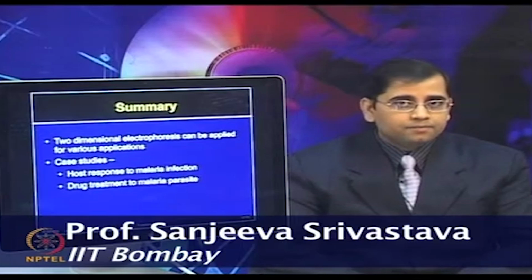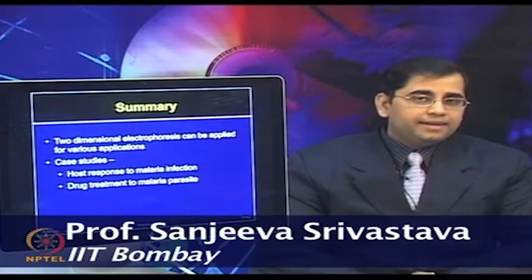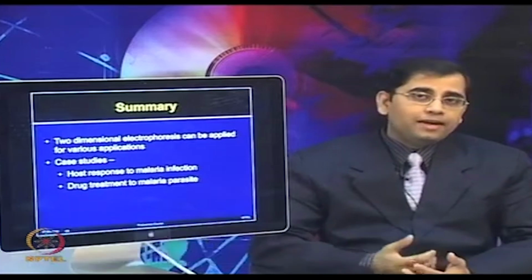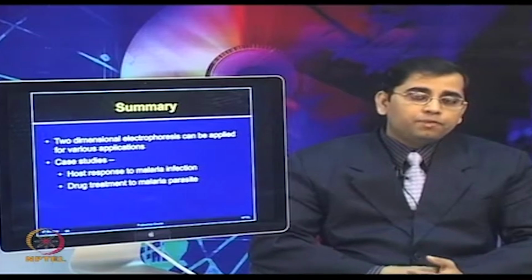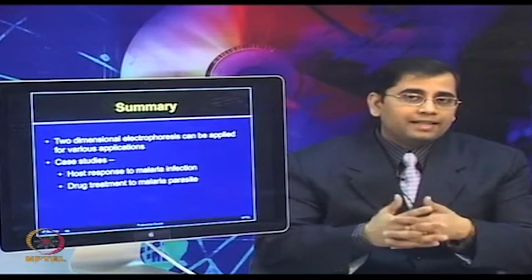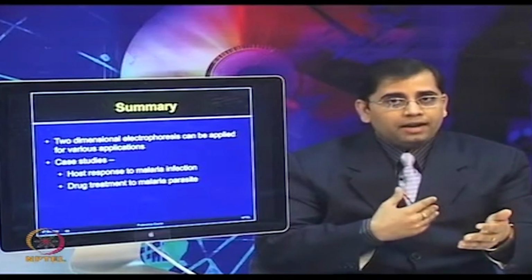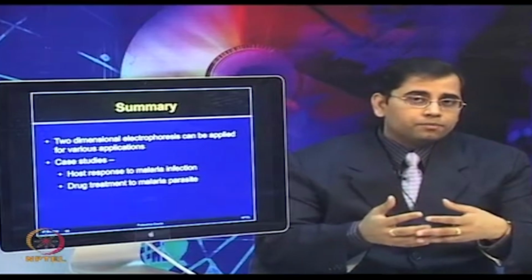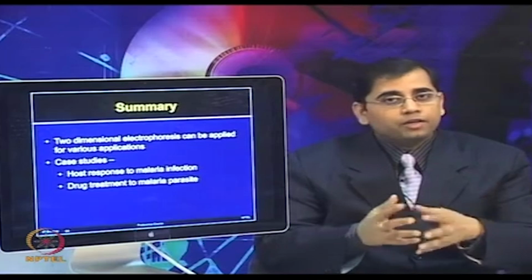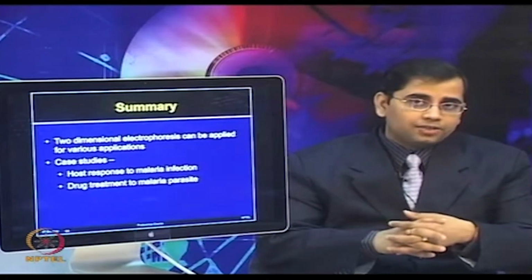the next class. But by giving you a case study and details of various types of experiments one needs to perform, probably you got an idea that before performing the final experiment on your cases and controls, a lot of optimization has to be performed, starting from your sample processing and how you can expand the coverage of the proteome. These types of quality control checks are very essential.